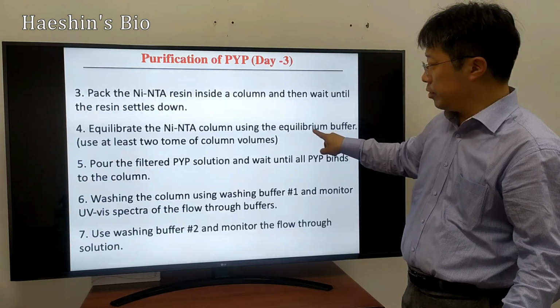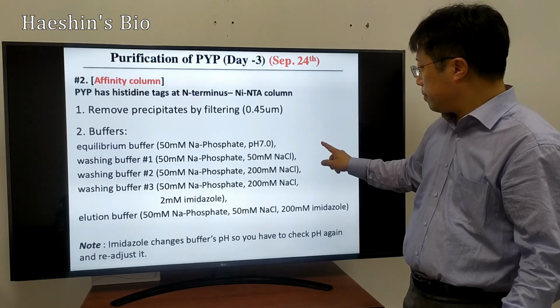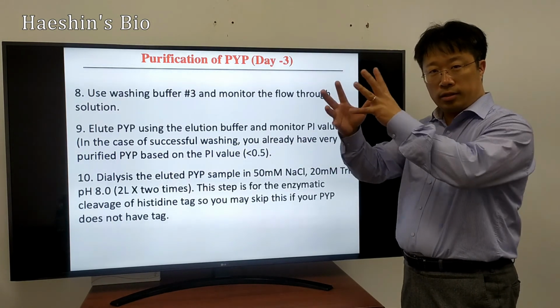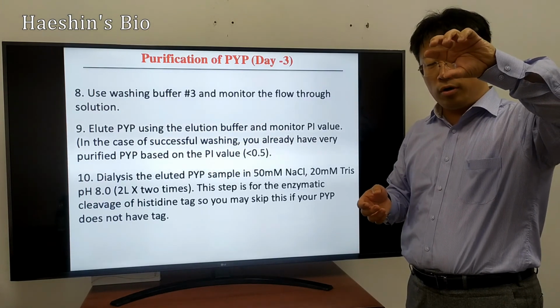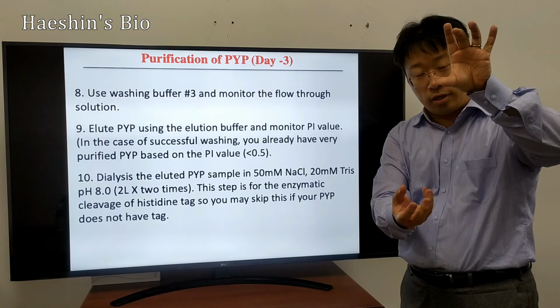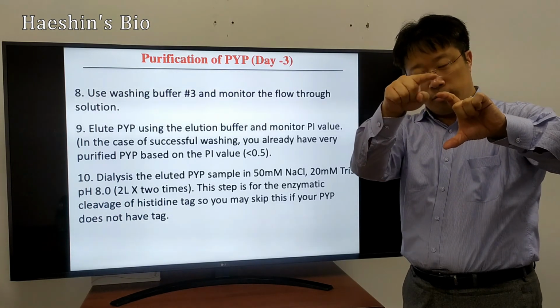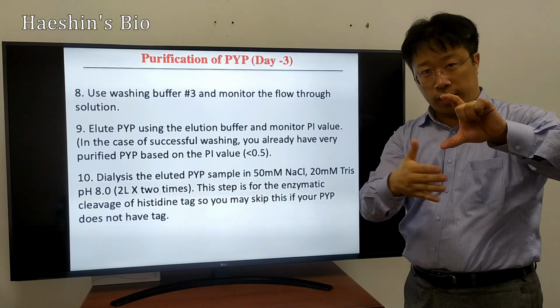Purity index here means the indexes I gave before. So that means we have certain fractions that are still to be collected, even eluted. As soon as you elute it, you pour the elution buffer. That doesn't mean that we immediately get PYP. I mean, you actually pour the solution. If this is the size of the column, the imidazole solution goes in here very slowly. So you don't know which fractions will come in.